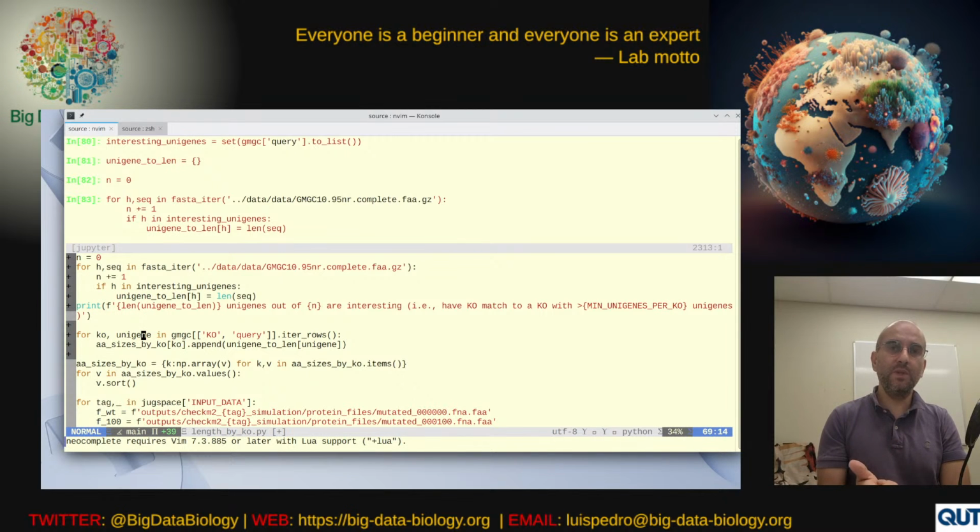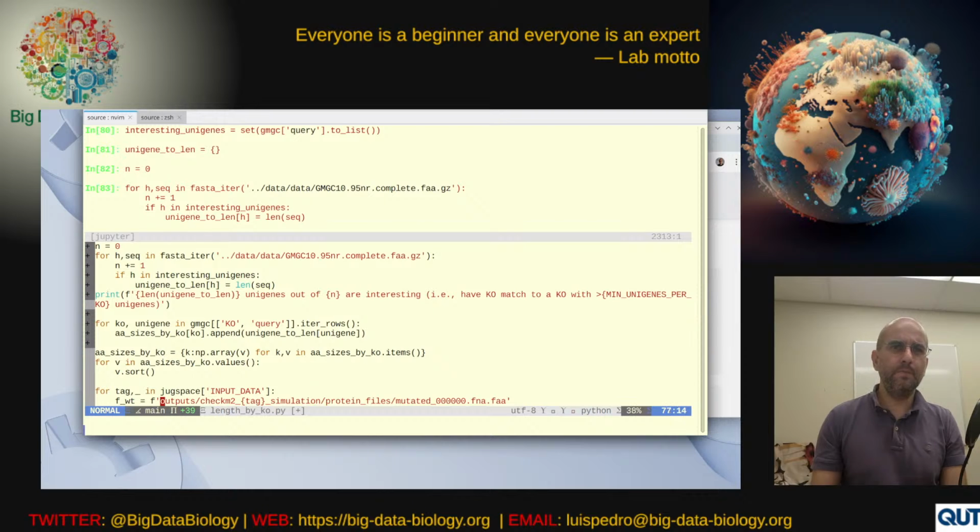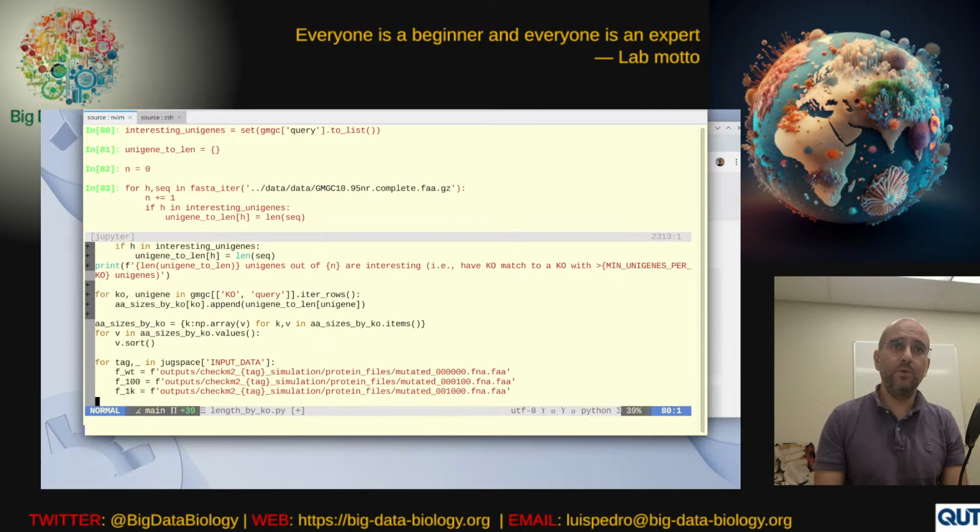We filtered to only include the complete genes, so it should be cleaner just from that point of view. It should have fewer outliers, because the outliers is what we're looking for. So if it has outliers in the complete genome, or the high quality genome, that's bad, because then we couldn't distinguish from outliers that are due to errors.